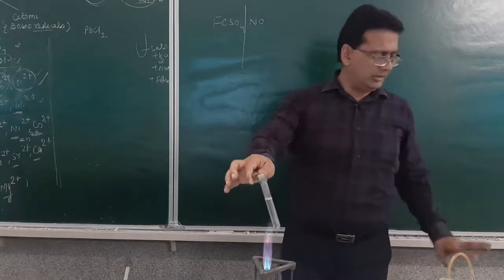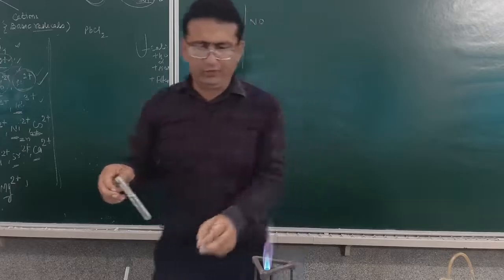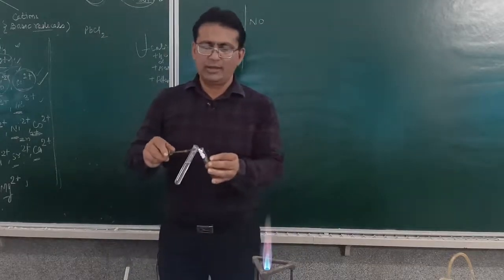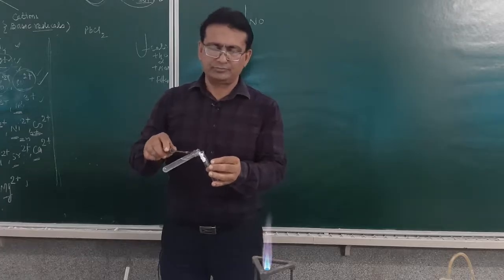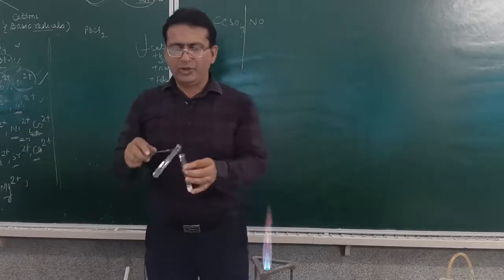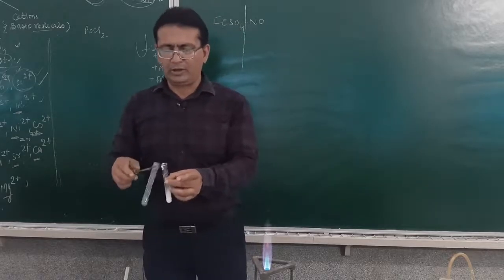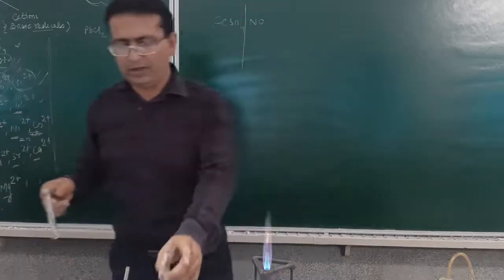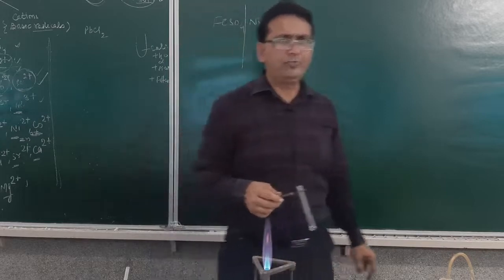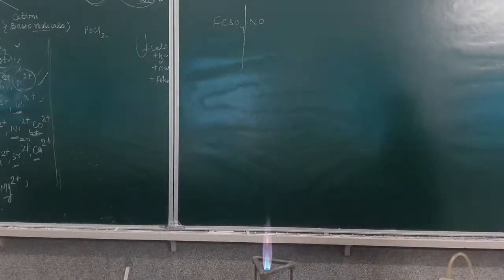When you find that it has got heated up, you have to add water to this, so as to dissolve the lead chloride. We all know lead chloride is soluble only in hot water. Is it clear to all of you?